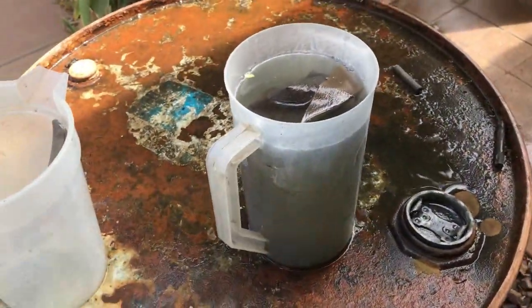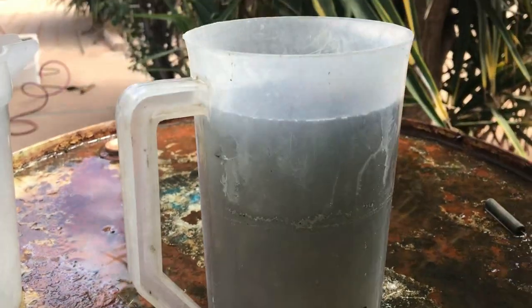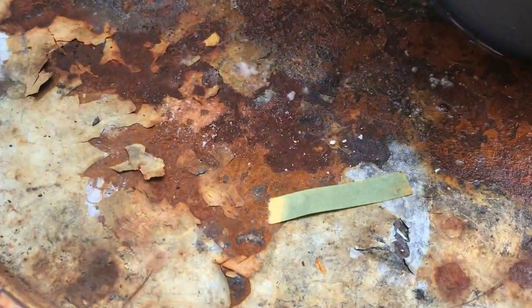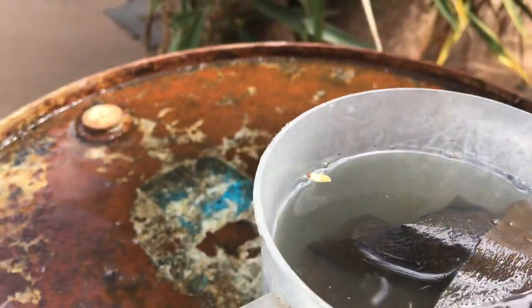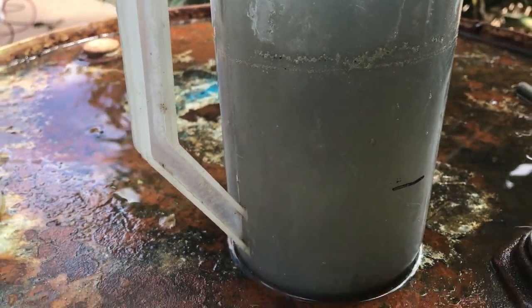I was thinking the sulfuric acid wasn't strong enough, but 20 ml of the acid I used went into one liter and it took a hundred grams of bicarbonate soda to neutralize — the bubbling stopped at a hundred grams. So I think it's quite concentrated.